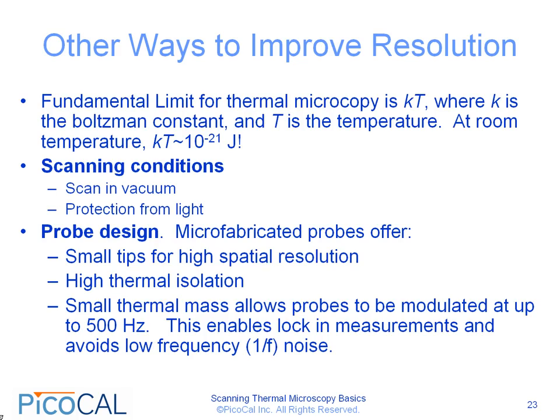Protecting the system from light will prevent the probe from heating up. Often these probes have a very high thermal resistance, and even shining a little bit of light on it can cause a temperature shift in the probe. It's very important to keep the probe system away from light in these cases.